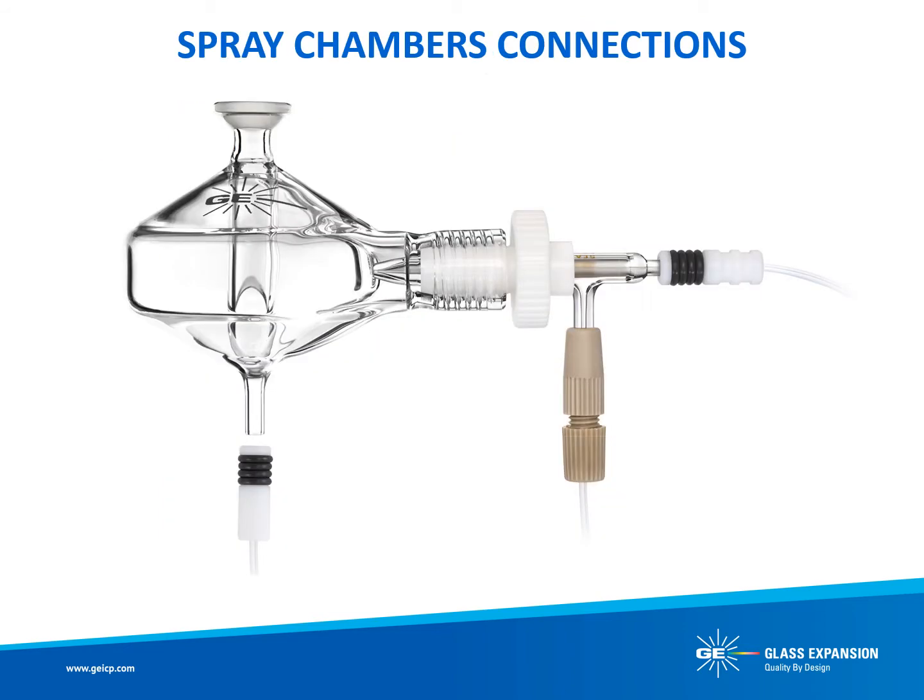Now let's look at a few spray chamber connections. While several of the features in Glass Expansion spray chambers were discussed in Spray Chambers 101 webinar, two of them are relevant to today's topic: the UniFit drain connector and the Helix CT.